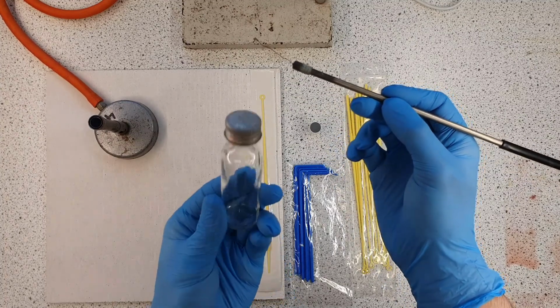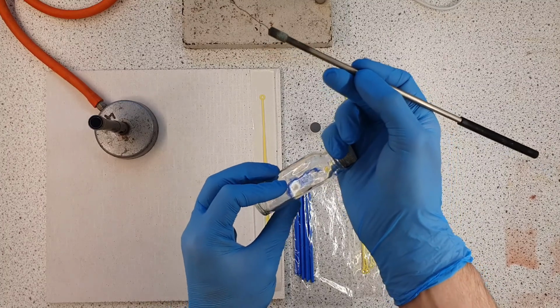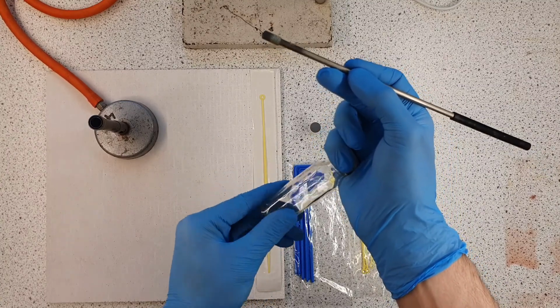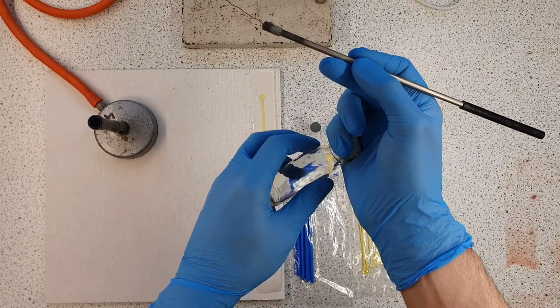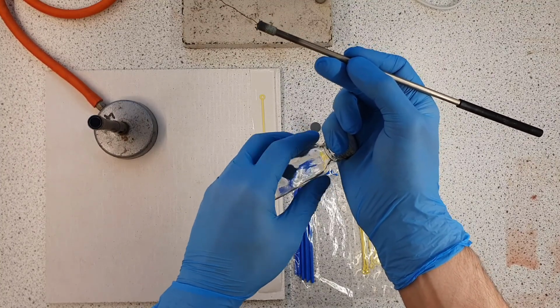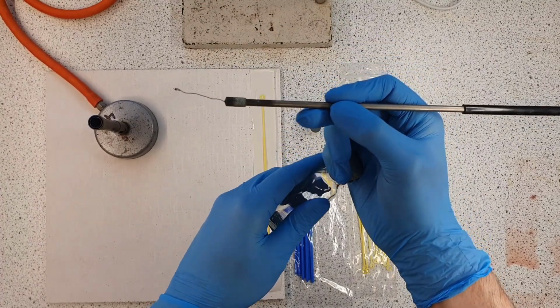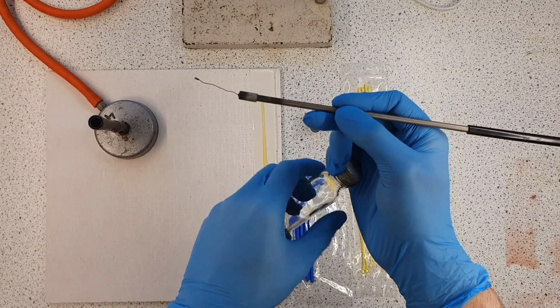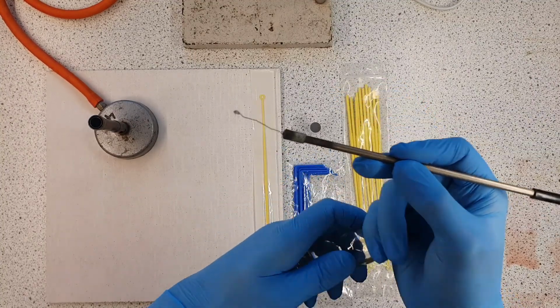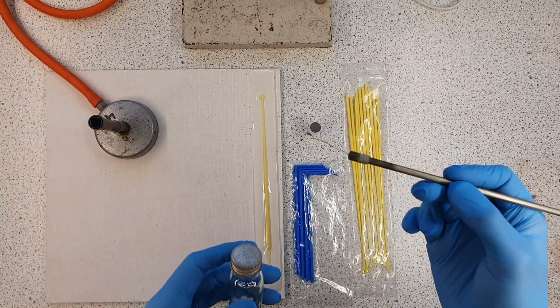But for example, as we open this bottle, we're going to be nestling it in our little finger there and just twisting it gently. Not necessarily twisting with your right hand or your dominant hand, just twisting it with your other hand and opening it. And again, as well as trying to keep it open for as little time as possible, what we're also going to be doing, this is a separate part of aseptic technique, is what we call flaming the neck of bottles, especially if they're glass.